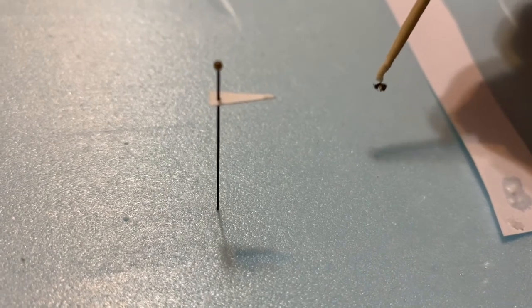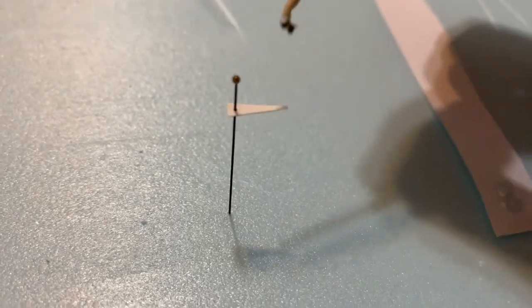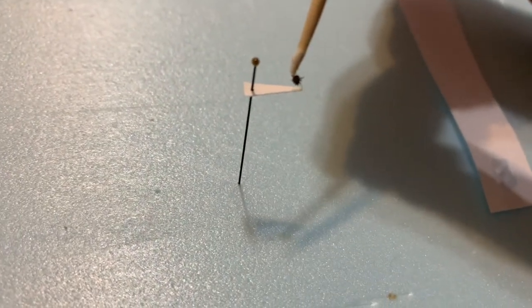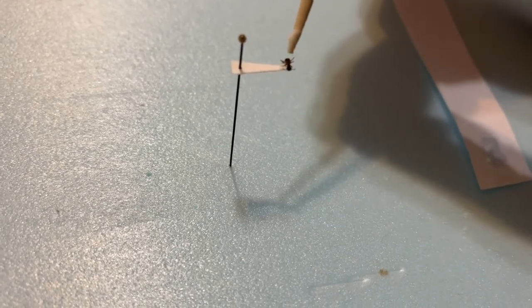Now this is a little bit technically challenging. It takes a little bit of practice, but you can touch your toothpick or pin with the glue on it to your insect and place it gently right on the end of your point.